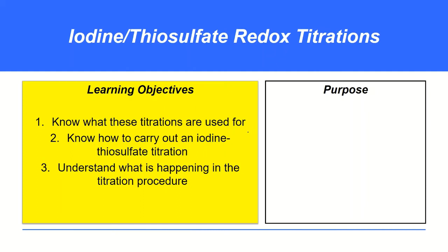Welcome to this video on iodine-thiosulfate redox titrations. Our first learning objective here is to know what these titrations are used for, and the purpose of an iodine-thiosulfate redox titration is to analyse oxidizing agents.